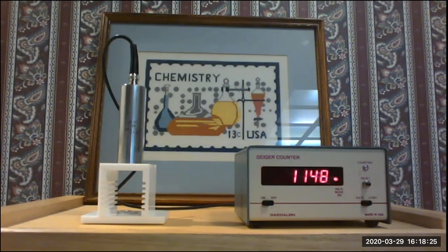So we're going to get a bit better estimate of that using a graphing technique, which we'll talk about after we're finished collecting all of the data. So in order to get a good trend line, we're going to need a couple more pieces of data. So we're going to collect it at 4 minutes and 5 minutes as well. So let's go ahead and collect two more pieces of data.